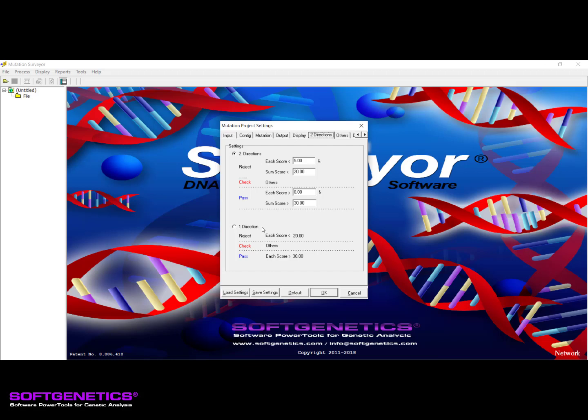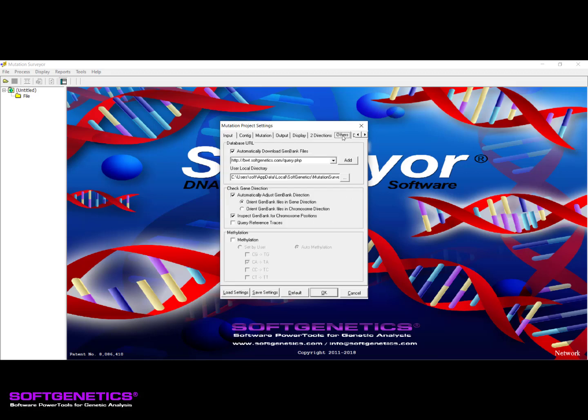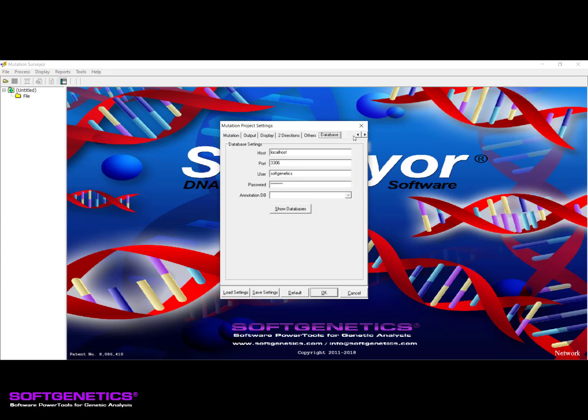The Others tab provides alignment settings including GenBank download and orientation settings as well as methylation settings. Finally, the Database tab, located on the far right, provides settings for your reference database that can help provide chromosome coordinates when the downloaded GenBank file does not contain them. However, please keep in mind that when first working with the software, we recommend using the default parameters as these will be appropriate for most projects.